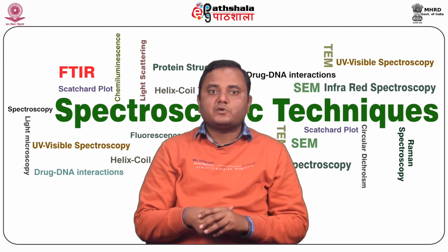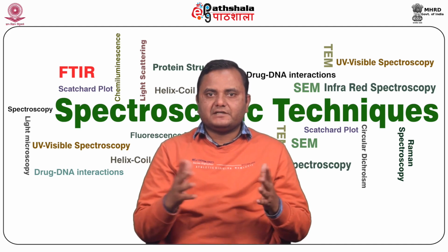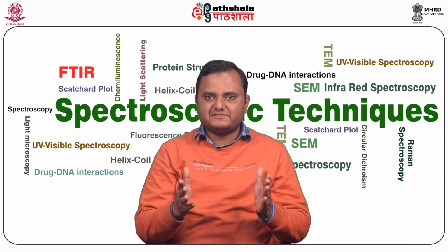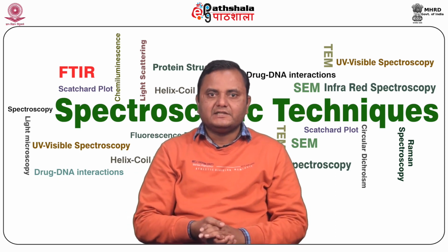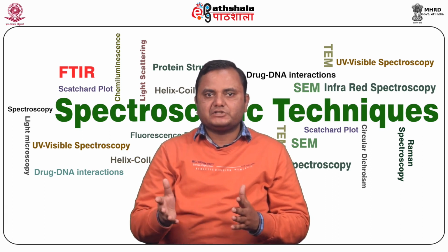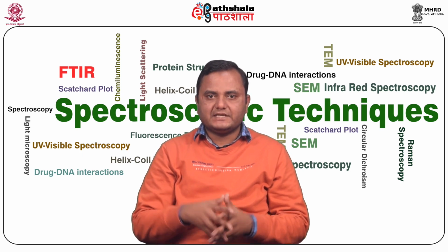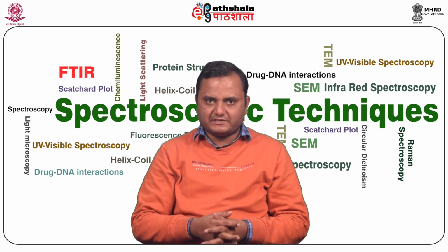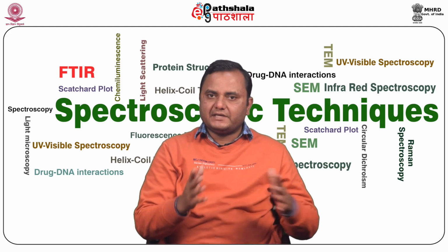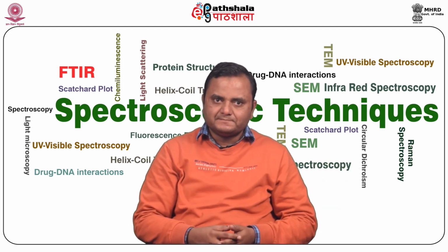Now we discuss the solvent effect. Solvents generally affect the fluorescence emission spectrum. There are two kinds of solvent effect, one is the specific and another is the general solvent effect. The specific solvent effect is actually a chemical reaction of the excited state with the solvent, for example hydrogen bonding, acid-base interaction, charge transfer. These are very specific phenomena that occur because of the chemical structure of the molecules under investigation.